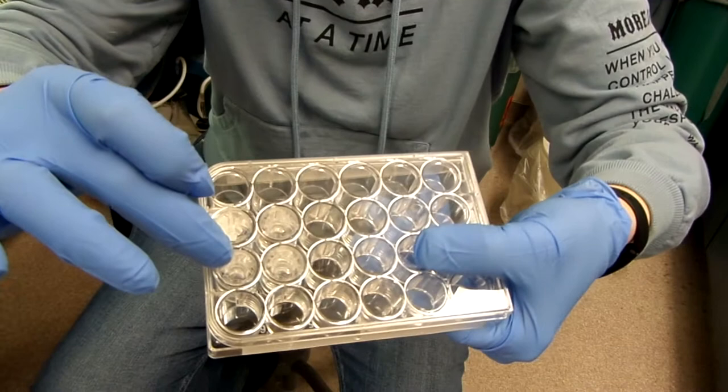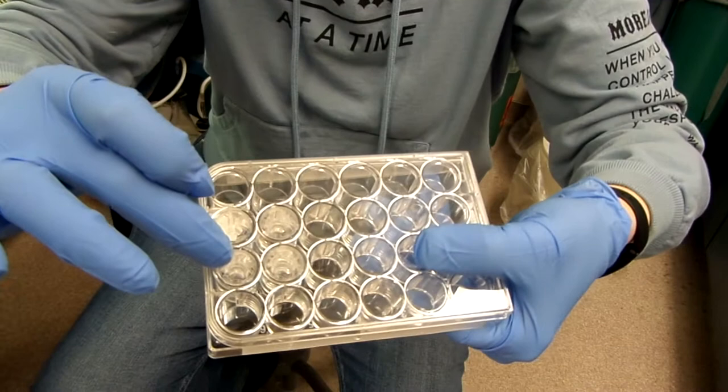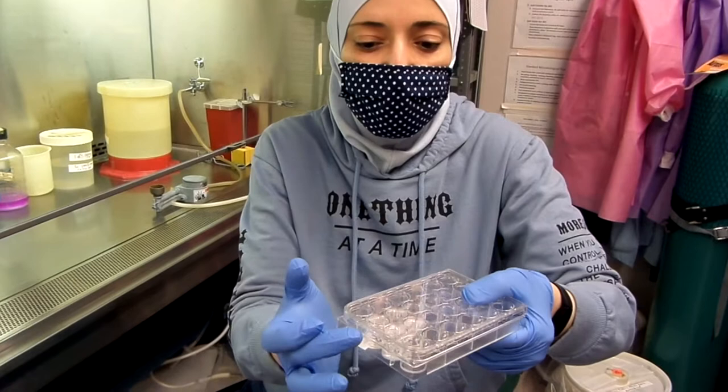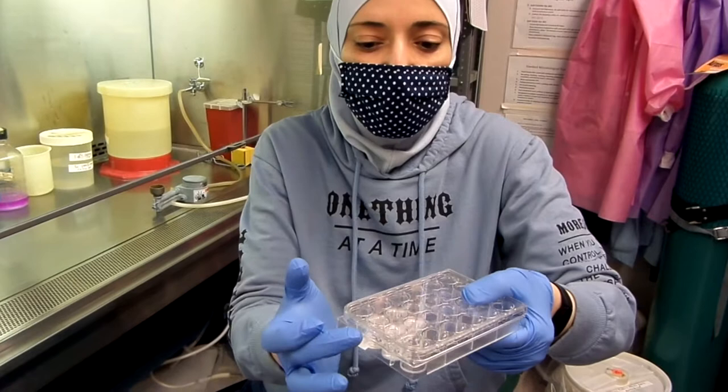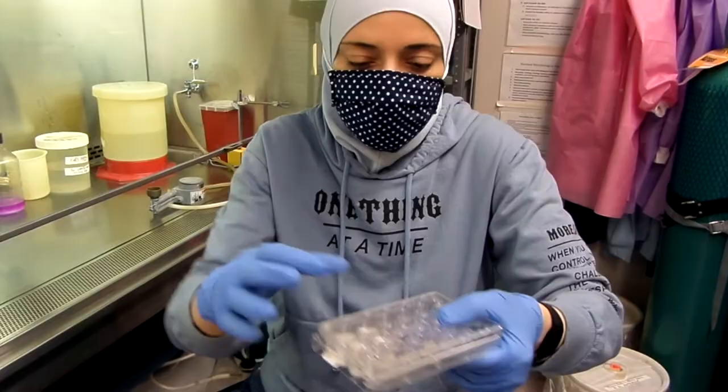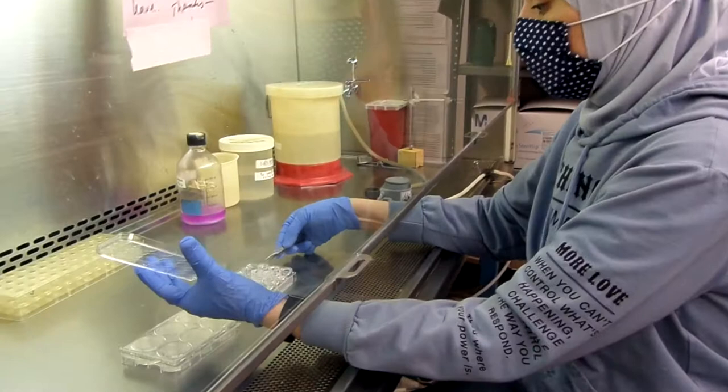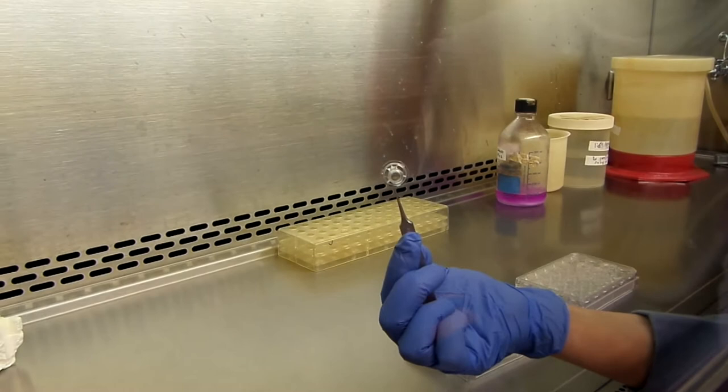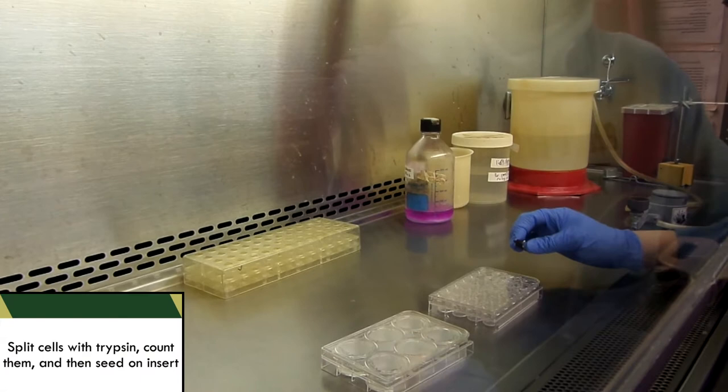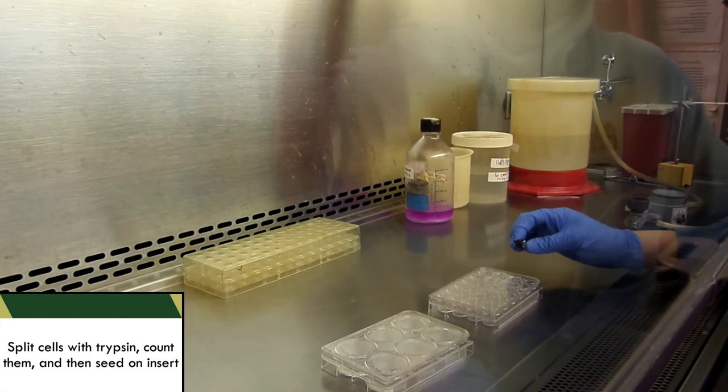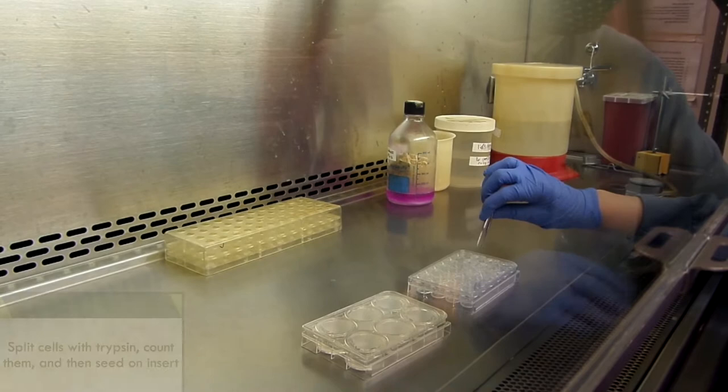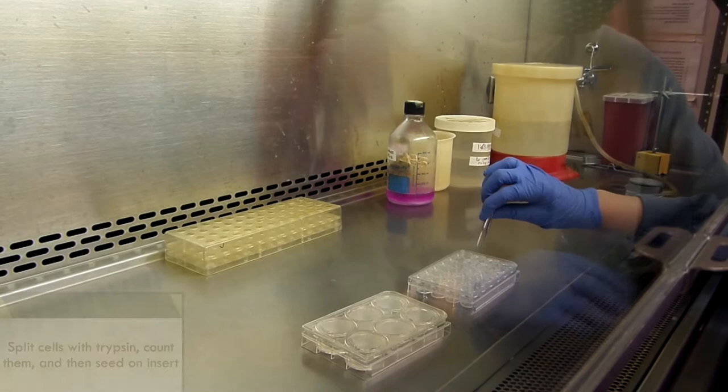I will seed the cells into the insert in here. This is the upper chamber. And I will allow the cells some time to migrate through the pores into the lower chamber that has the epidermal growth factor or the chemoattractant. Let me show you the insert. This is the insert, and the base has this porous membrane. What I will do is, I will split my cells using trypsin, count the cells, and then I will seed these cells on the upper chamber, and then give them some time to migrate.